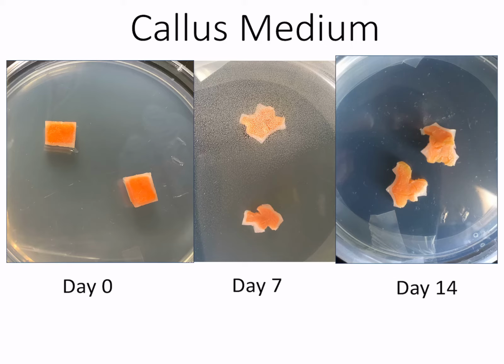To remind ourselves of our progression, we have day 0, where we had blocks of carrot tissue. Day 7, they're starting to swell. And day 14, they're continuing to change shape. And we think, or it's possible, that we're beginning to see some callus development.